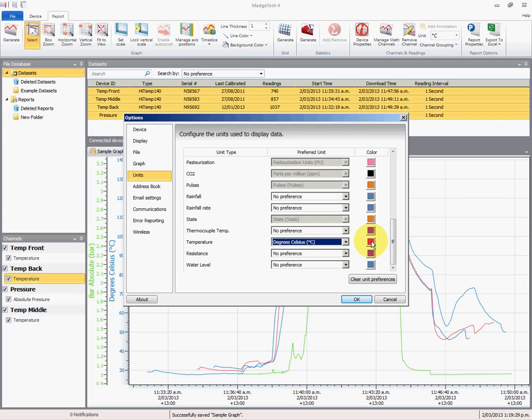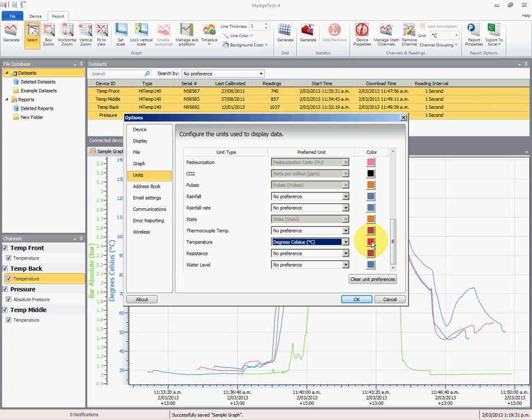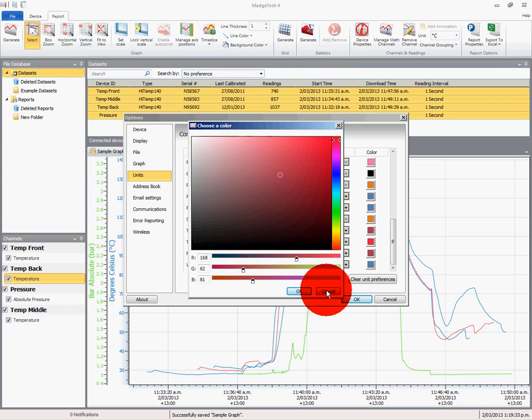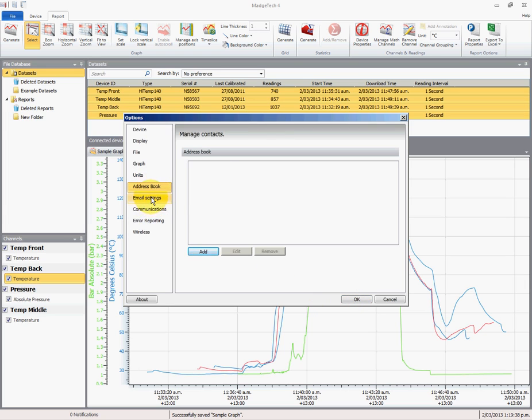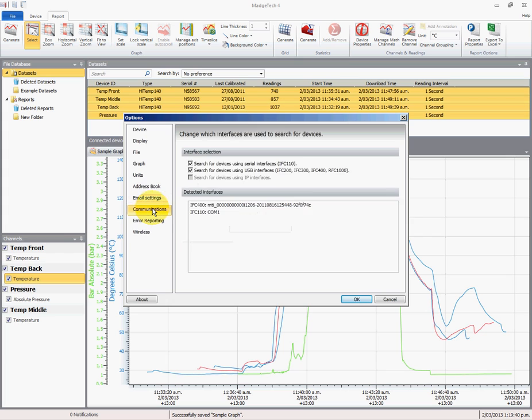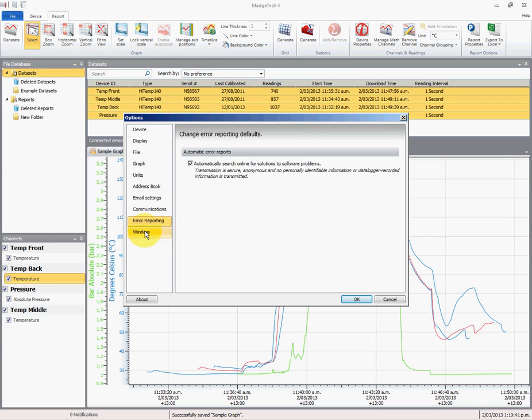Some of these other settings I haven't fiddled with yet, and we'll cover those in subsequent videos.